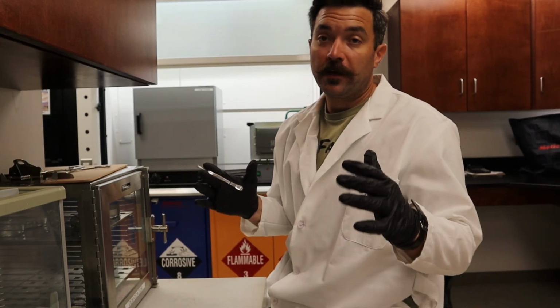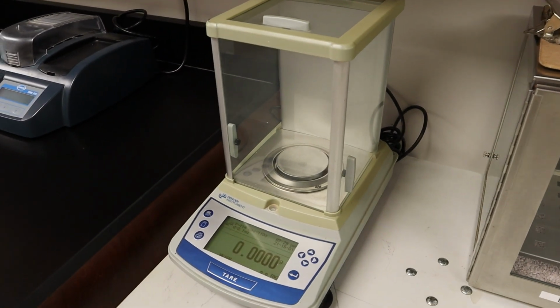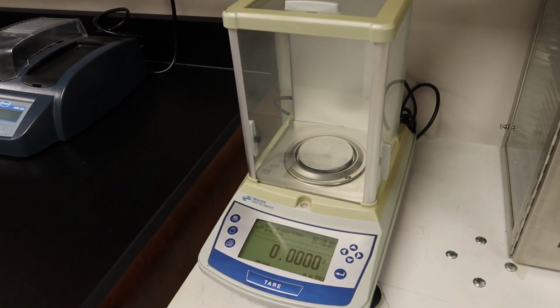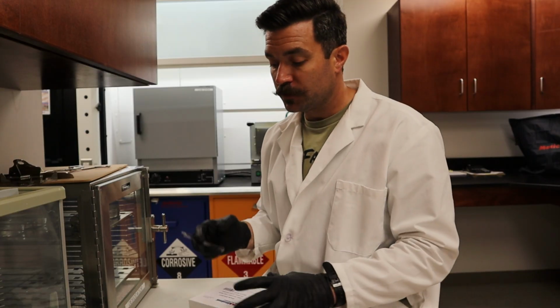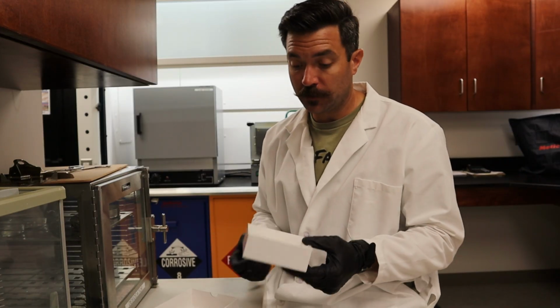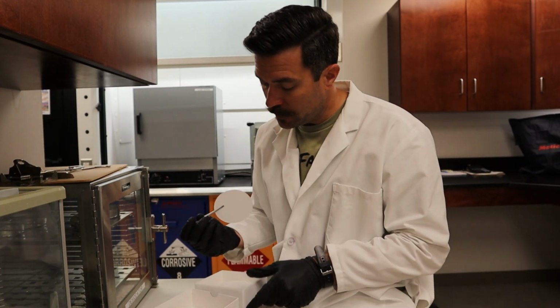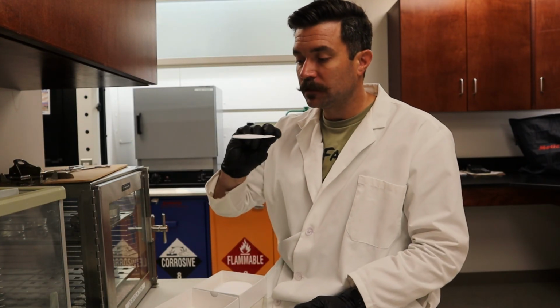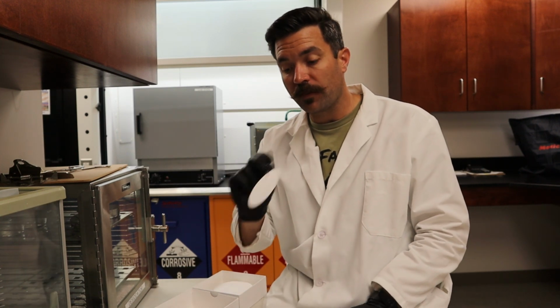Alright, Turd Nerds, we're over here at our balance. Your analytical balance is a very important part of this process. You have to actually weigh your filter before you start the whole thing, so you know that initial weight. Very important number to have. So what we're going to do is take one filter out of the box with our tweezers, and lay it inside the balance. And once that balance stops and gets to the weight, we're going to record that number.